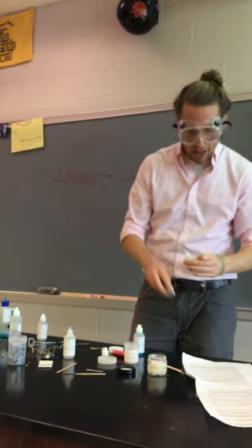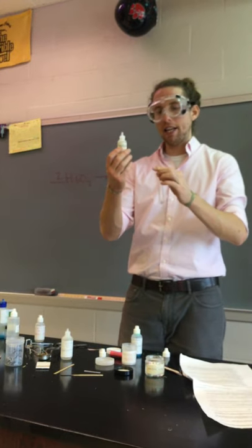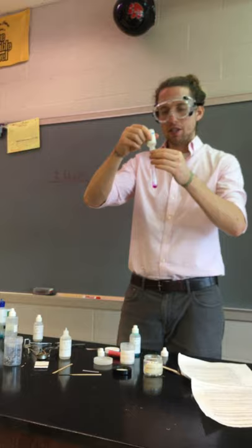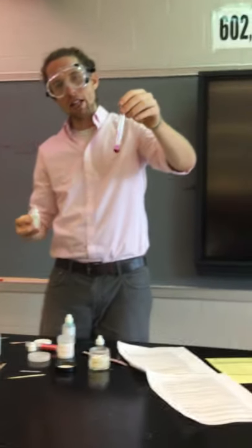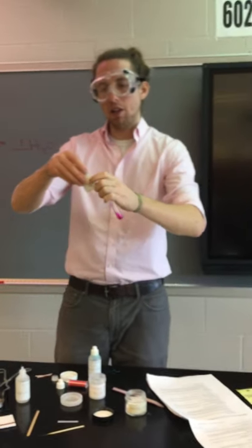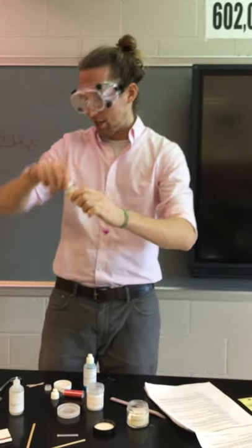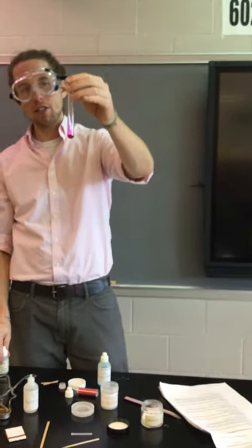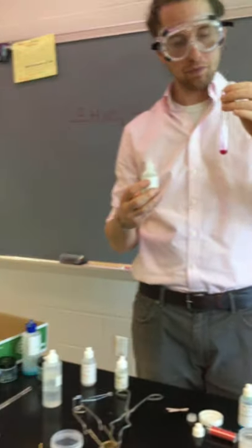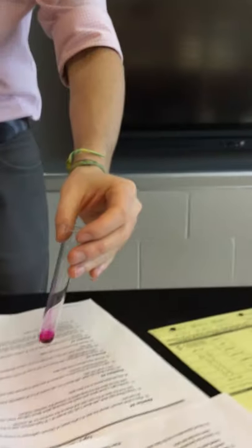So in addition to the 20 drops of sodium hydroxide, I'm also going to add in a few drops of phenolphthalein indicator. Now phenolphthalein indicator is really cool because in the presence of base, it turns pink. Now when it's neutral or if it's in acidic solutions, it remains clear. So what we want to do now is take our sodium hydroxide, which is a base with this pink indicator in it, and we're going to add acid to it. And we're going to figure out how much acid it takes to turn this thing clear. And we're going to go on the white paper.